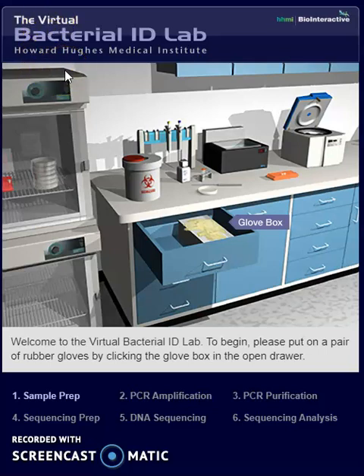23-20F1012. Today I will do a lab simulation for the bacteria ID lab. This lab has 6 steps, which are sample prep, PCR amplification, PCR purification, sequencing prep, DNA sequencing, and lastly sequencing analysis.